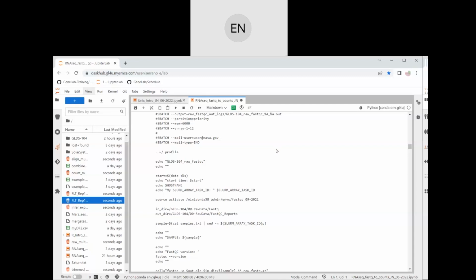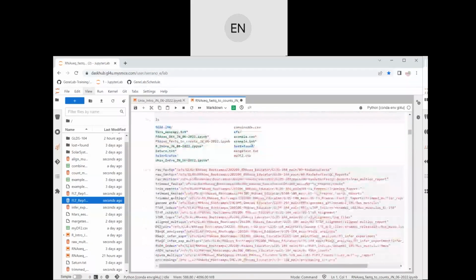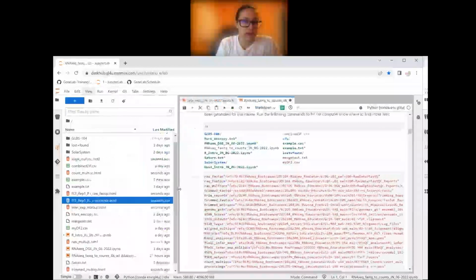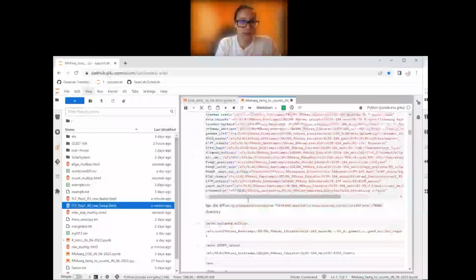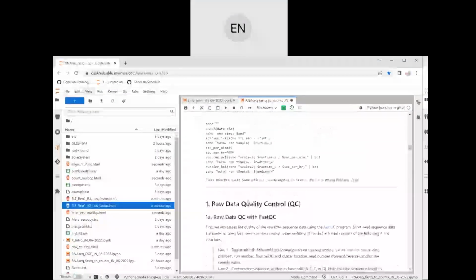Let me find out where it is. Here are all of these. You can go ahead and see on the left what's there. So it does look like it's there. And then when you added a code block and ran PWD, yeah, I did that down there. It says I'm in home. I mean, I can do it again.